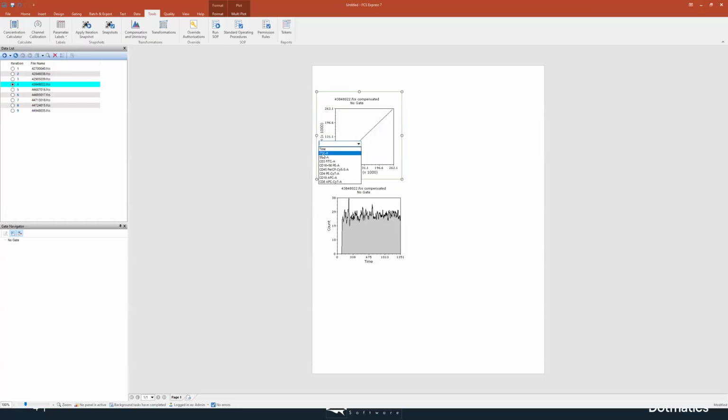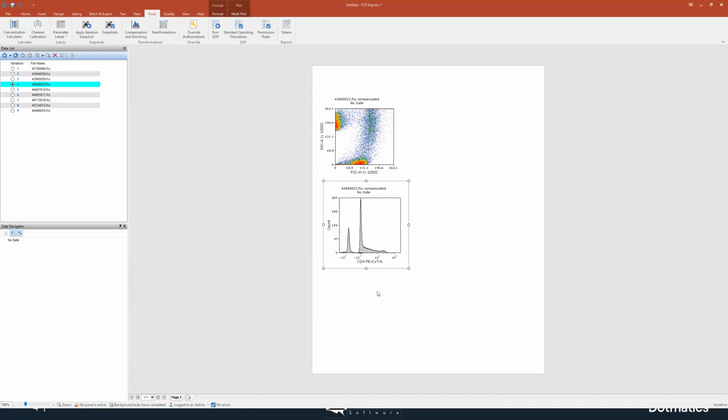You'll see that the borders are gone, the border around the text, the title is gone. We've closed the frames, made everything black. So this is maybe a little bit more of a standard, maybe what you're used to seeing as a default plot. For our histograms, the histograms are now filled by default, just to make them a little bit more visual. Of course, you can change these to whatever you want.